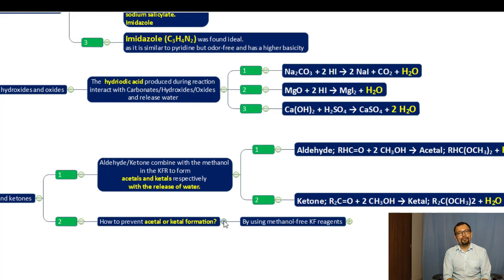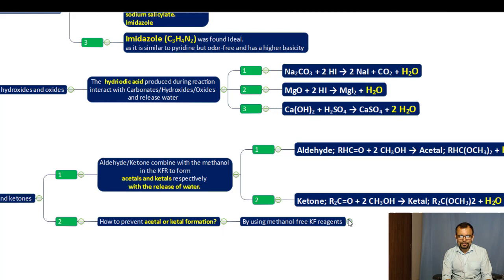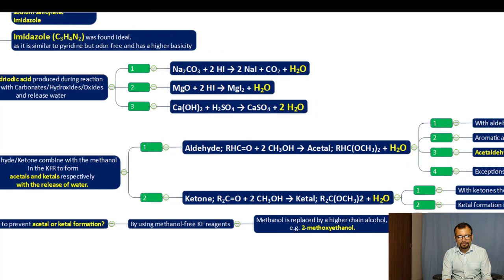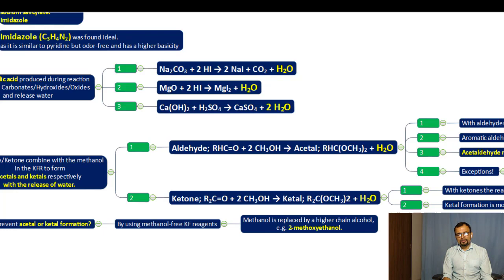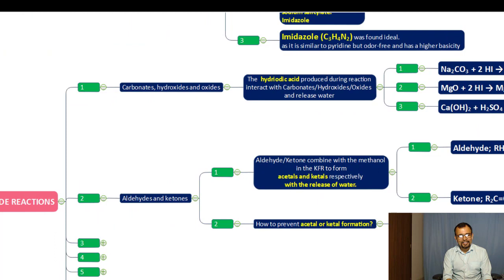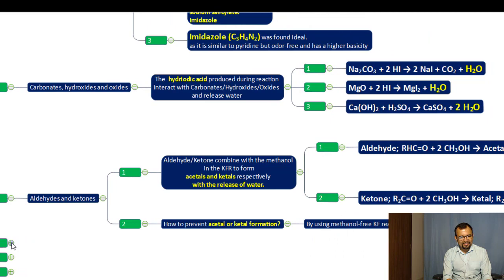To prevent acetal and ketal formation, one can use methanol-free KF reagents. Since methanol reacts with ketones and aldehydes, removing it prevents this side reaction. A suitable replacement for methanol is 2-methoxyethanol. Special methanol-free KF reagents are now commercially available and can be used for determination of water content in ketones and aldehydes.